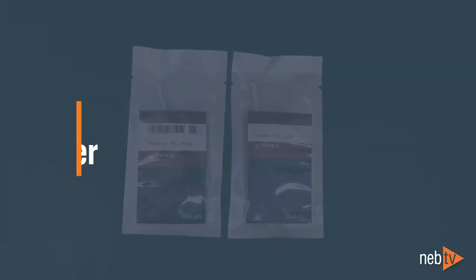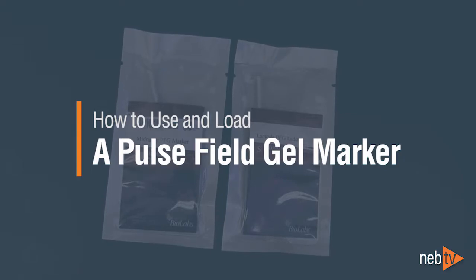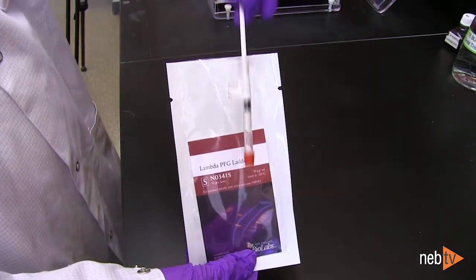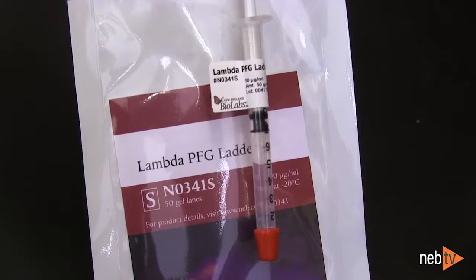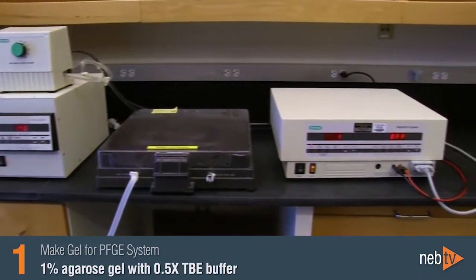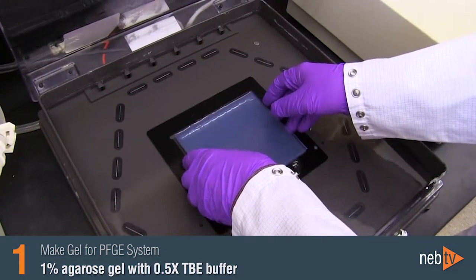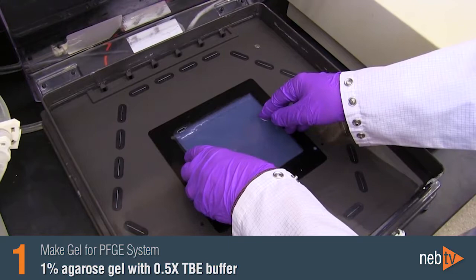In this video, I'll demonstrate how to use and load a pulse field gel marker, or PFG marker. NEB PFG markers come in solid agarose plugs contained in syringes. First, you will need to make a gel for your PFG electrophoresis system. We recommend making a 1% agarose gel with 0.5x TBE buffer.